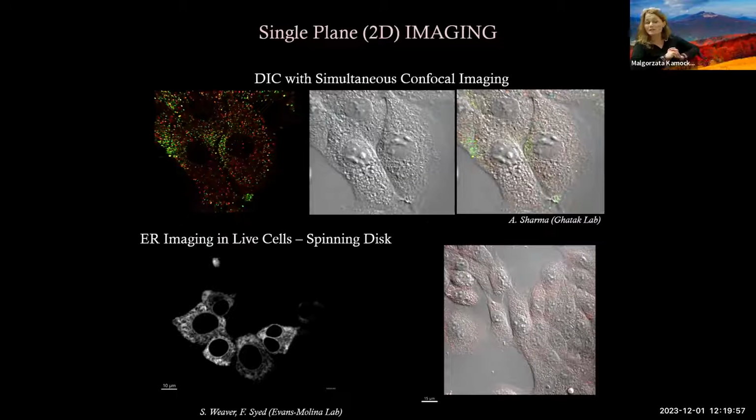So sometimes it happens, especially for live cell imaging, like we have here, that we label only certain structures of interest, but we don't want to label nuclei or other structures, sometimes even membranes, so as not to influence the metabolism of the cell. So in that case, having a DIC image gives us an idea if cells were happy, if they were really creating a nice monolayer. It's very nice to have this information.